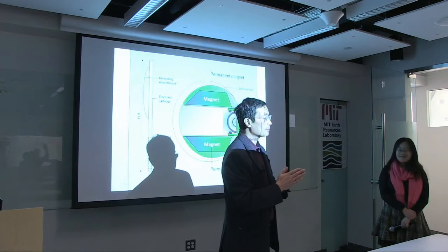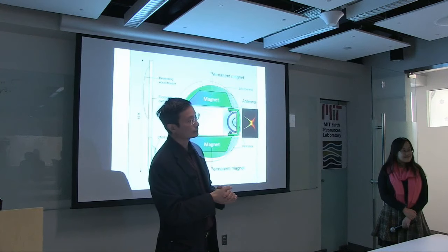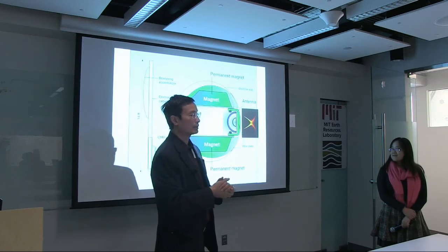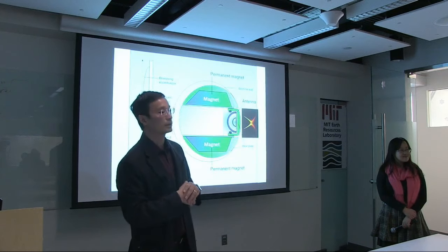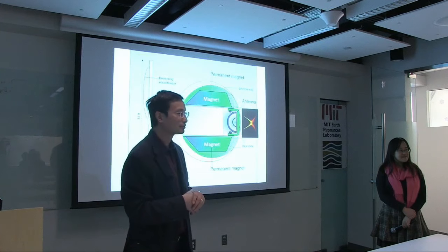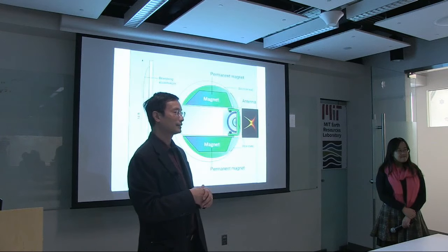So yeah, when you're controlling the equipment to change the depth of investigation, are you changing the magnetic field gradient? Are you typically looking at a different antenna frequency? Yeah, we typically change the frequency. I think this is an audience that would like to hear a little bit about the physics, because you've done very well on the interpretation and on the statistical signal processing, but the underlying physics is really quite interesting.